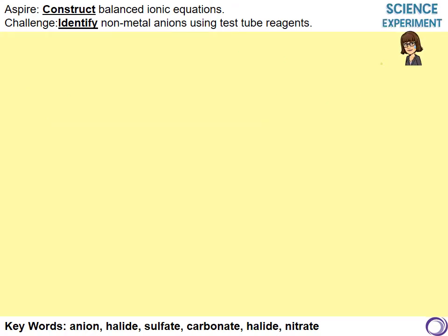In the following video, Mrs Jennison is going to explain and demonstrate how to do the tests for the 3 types of ions.